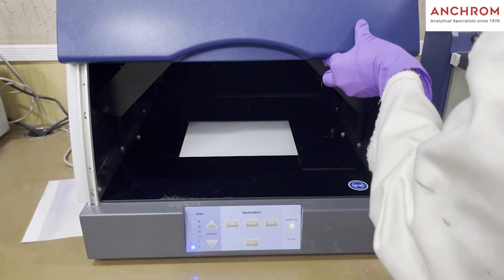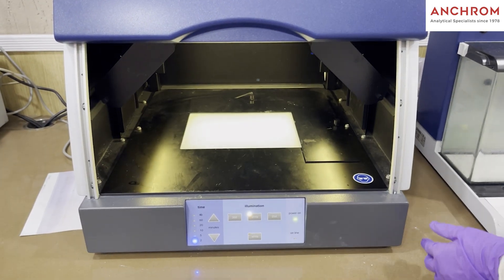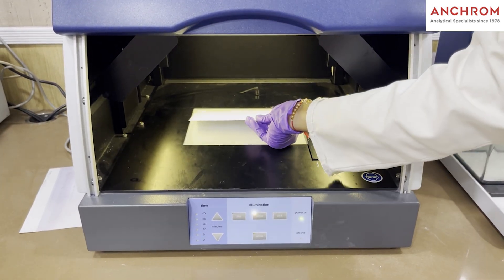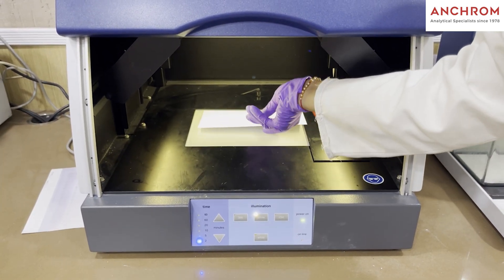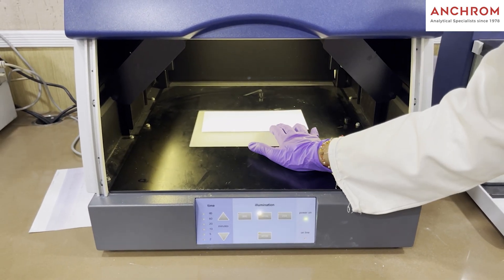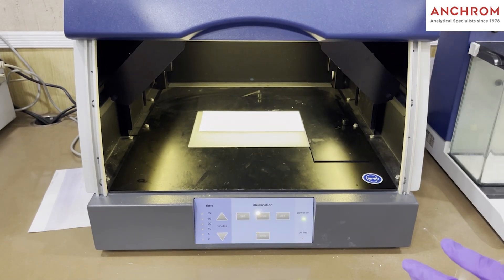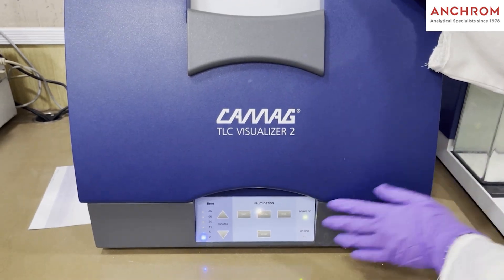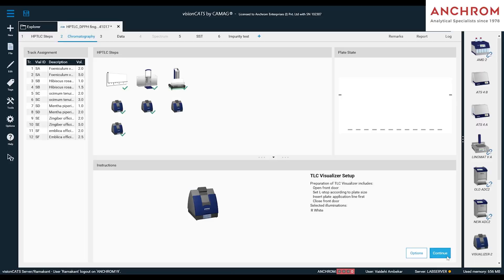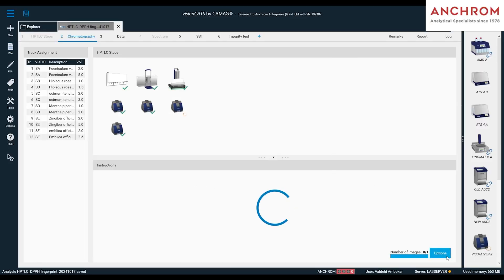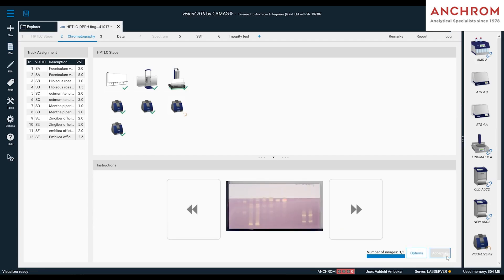After completion of the reaction, place the plate in the Visualizer 2 to capture the image of the derivatized plate as shown. Click continue to capture the image and then click on accept.